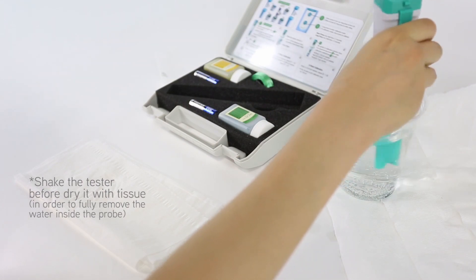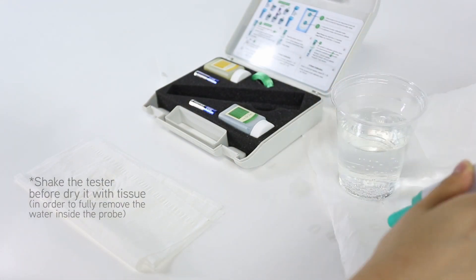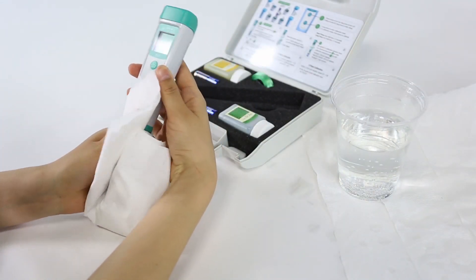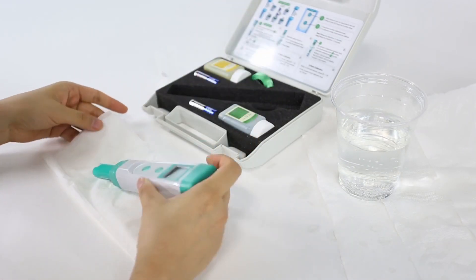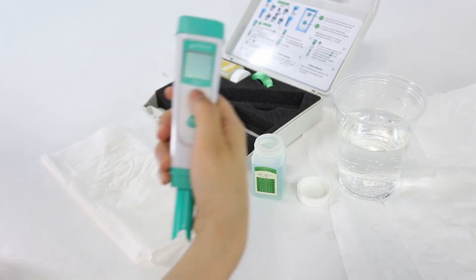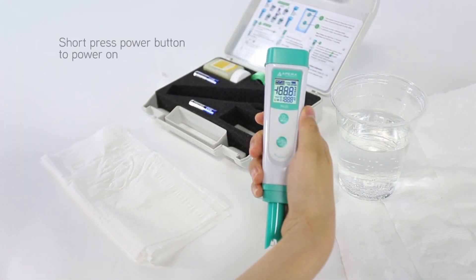Clean the probe in distilled water and dry it. Short press the power button to turn on the tester.